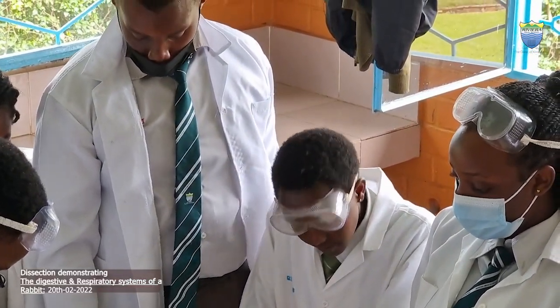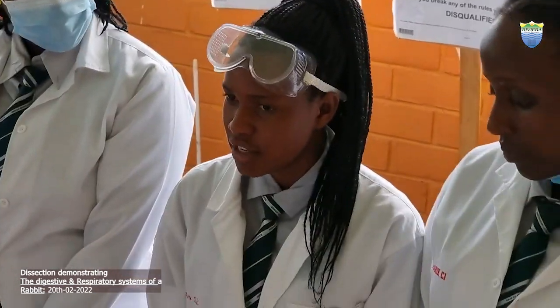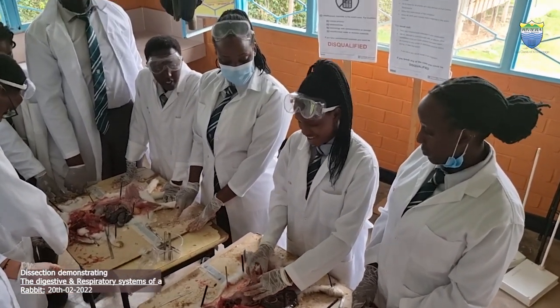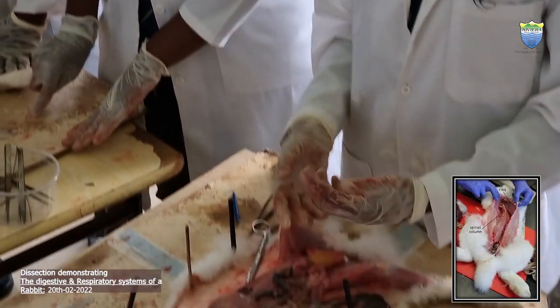Also, as you're eating, not all the food is chewed to the same extent. What is not chewed very well is what we see as the faecal waste products in this intestine. So they will get out of the body through the anus.